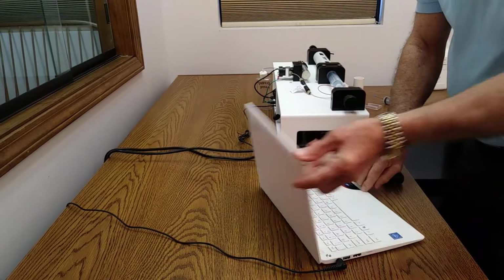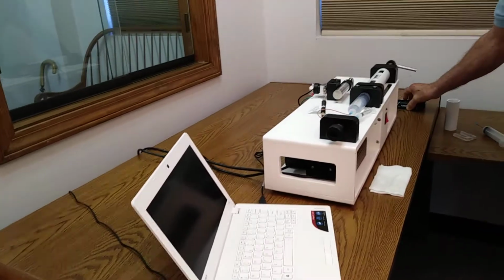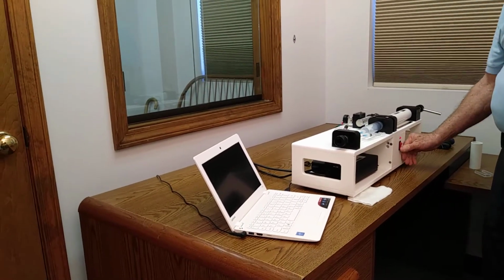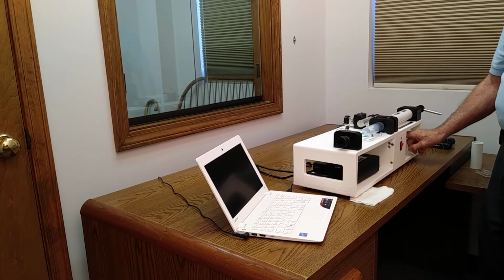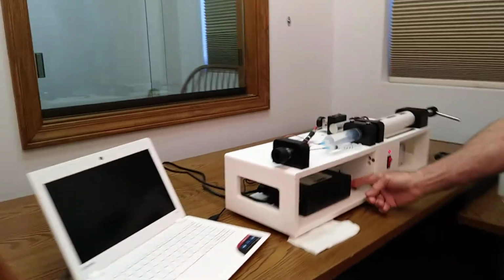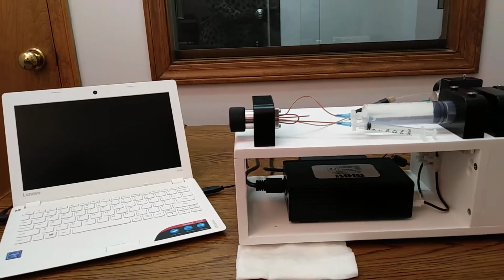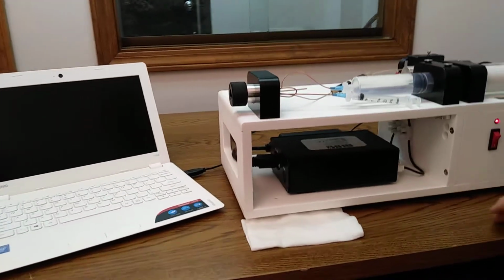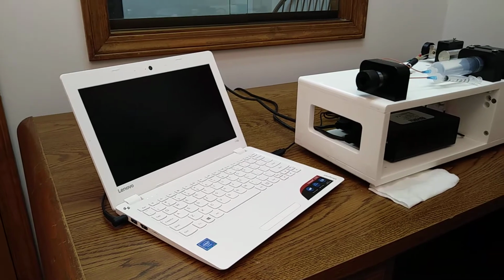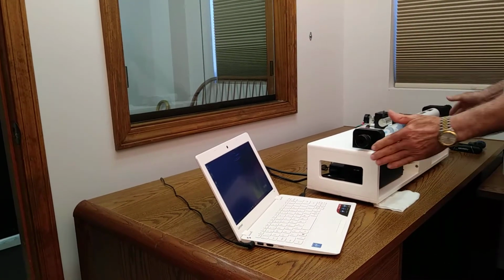Open this up. Now we're going to turn everything on. This switch turns the power on to the computer. A switch located underneath here turns on the high voltage lamp. And of course we turn on the computer here. Okay, now we have assembled everything.